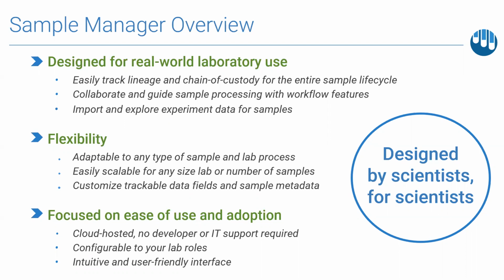Above all, though, Sample Manager is intended to be flexible. Flexibility is a very key theme for LabKey Sample Manager. In fact, uniquely, the product is not confined to managing samples just in the biomedical and life science area. Sample Manager can actually be used to manage virtually any sample type. And it's also very easily scaled for laboratories of different sizes and for those with different data capture needs. So flexibility is a theme that we'll return to time and again.